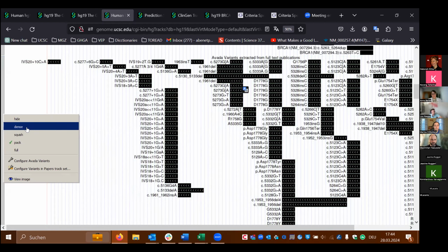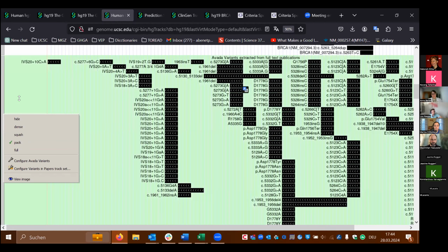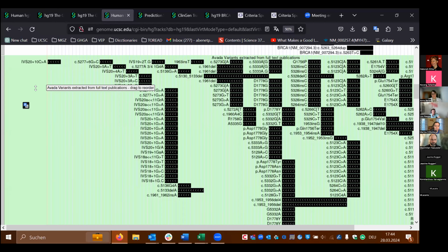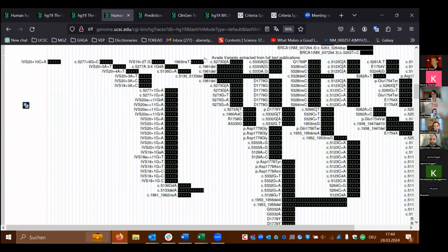And then it saves your last view, or the view that you like. So you can customize it so that each time you come back, you're viewing it with the tracks you think are important expanded, and the tracks you want to know about but don't need expanded collapsed. Again, we have some biocurators on the call that are a bit newer or maybe have not invested in using UCSC Genome. So, yeah, what you were telling now, I will just show, for example, this track here.